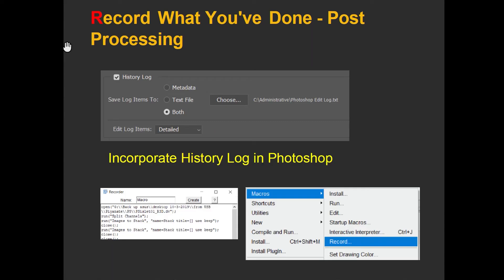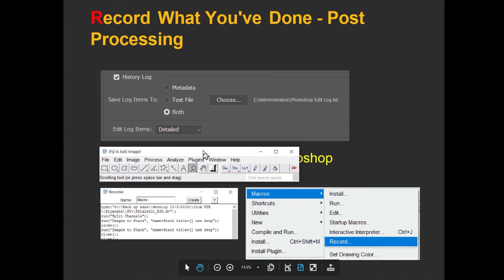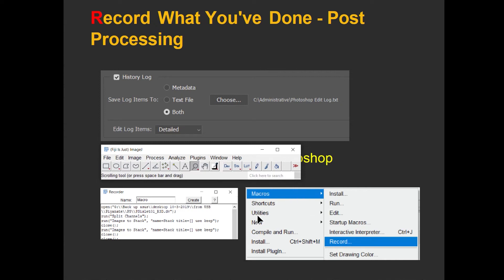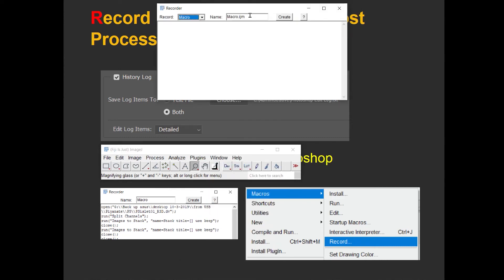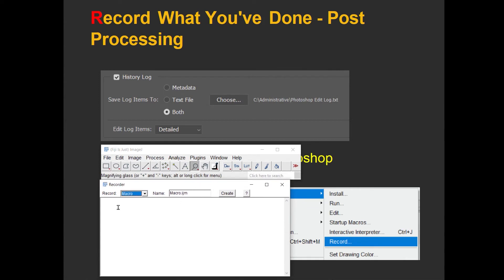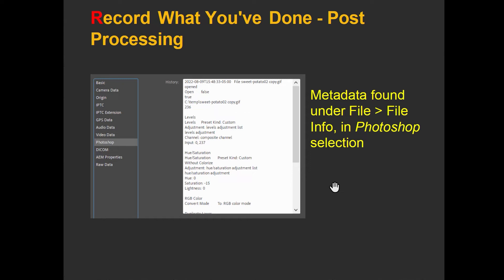If you're using ImageJ, you can incorporate a way to record what's being done to an image. It's a little clunkier, but in ImageJ you can include a macro to record what's being done while you're working on it. Go to Plugins, Macros, and choose Record — you'll get a recorder, and as you're working it will record what's being done. Whether or not you use History Log in Photoshop, Photoshop will record what you're doing to the metadata, found under File > File Info. That's saved with the image as long as you save it as a TIFF or Photoshop file.